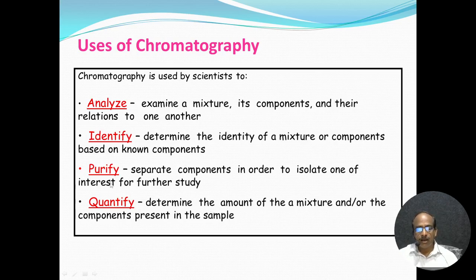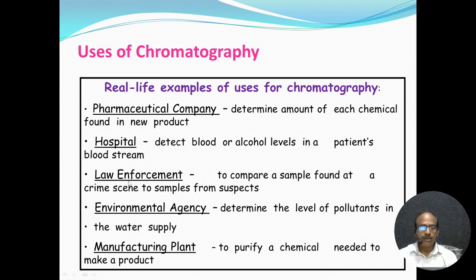These are all the parameters we use in chromatography. In real time, what are the live examples of chromatography? What are the general uses of chromatography? It is used in the pharmaceutical company, to determine the amount of each chemical found in the new product.